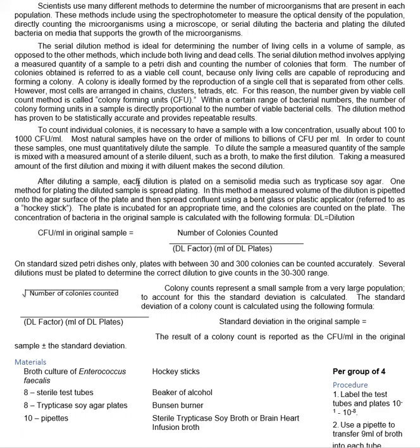But we're going to put it on the plates, and then we're going to use something they call a hockey stick. In our lab, it's a triangular piece of metal that goes up and comes out like a hockey stick as a handle.